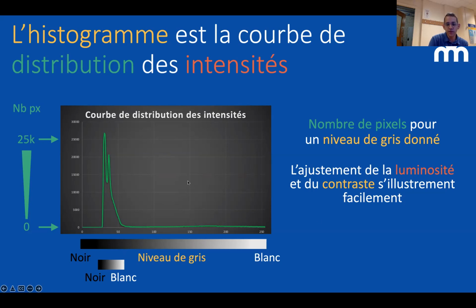So this curve is very important because it shows you the number of pixels for each gray level. If you add the numbers on each line together, the total is the total number of pixels available in your camera. Here, on the top right, you have the maximum bit depth of your camera, or whatever image you are looking at. So here you see that it's 255, and 255 corresponds to 8-bit gray levels.